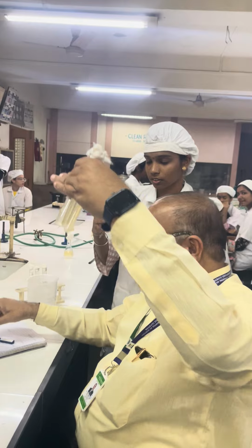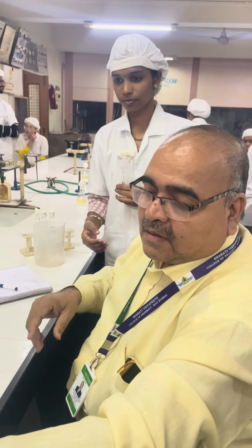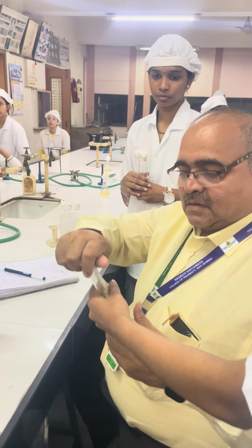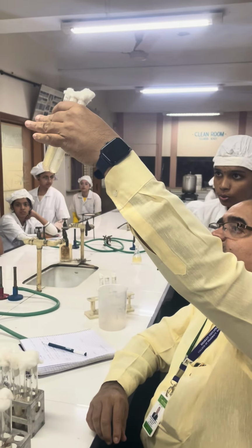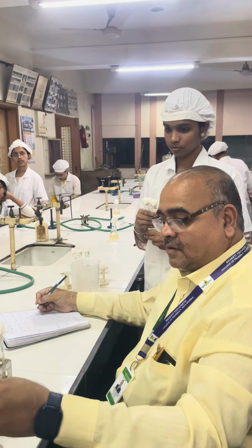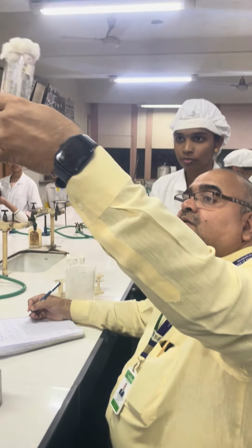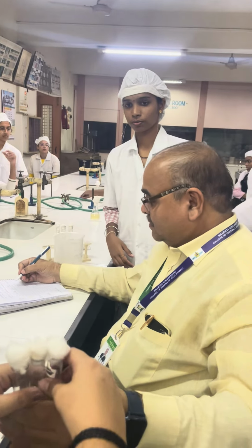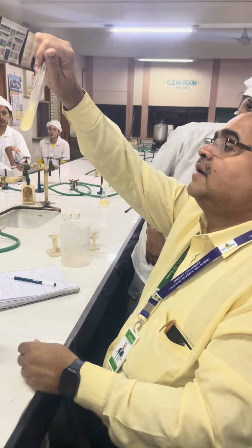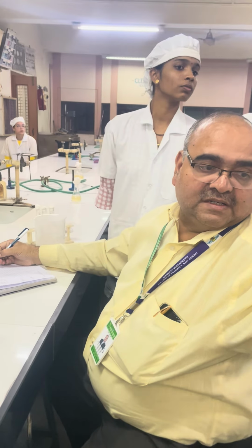You only tell me the number of tubes showing acid and gas production. I think only one. This is what? One. Third. This is what? Yes, see the number of tubes showing acid and gas production. How many? Two. Point one. See this. Two. How many? Bring that journal.